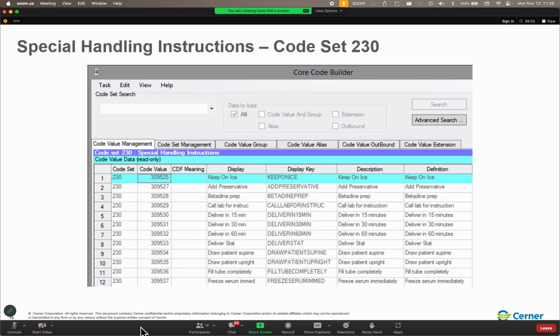So, accession setup global tab. This is where we say how many digits are going to be in the last part of the accession number. In my train domain, we have 4 digits at the end of our accession number. So that is our sequence length. And if we were working with alpha prefixes, we'd probably have 7.